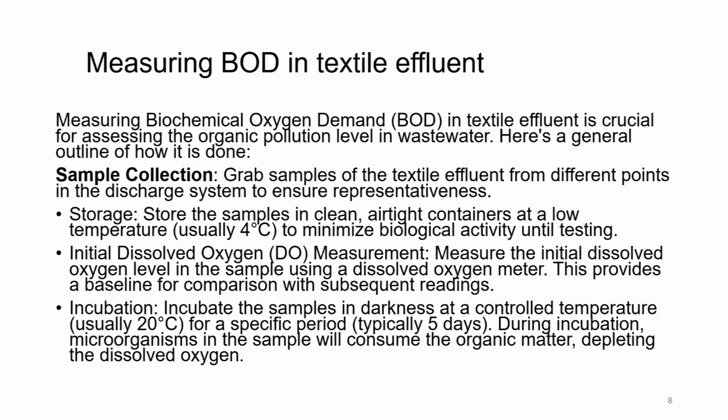So, how much of the oxygen is already present? That much will be required for the biological degradation. Incubation: incubate the sample in darkness at a controlled temperature, usually 20 degrees, for a specific period of time, typically 5 days, but it could be 7 days or 20 days as well, depending on which BOD method we have adopted. During incubation, microorganisms in the sample will consume the organic matter, depleting the dissolved oxygen.